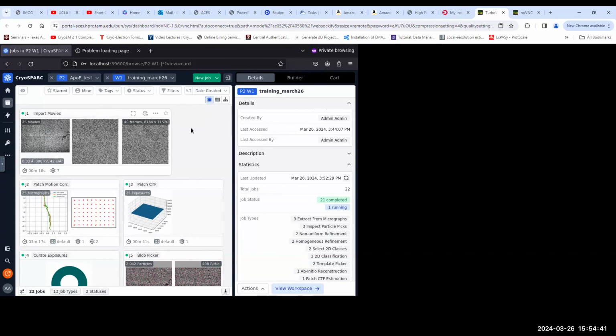And another thing: I had a student trying to do this last year, and I don't think things were set up as well as they are now, but we had problems with the size of the data set and the amount of compute time needed, because we were trying to reconstruct whole bacteriophage heads, about 85 nanometers in diameter, made up of about 1,000 proteins.